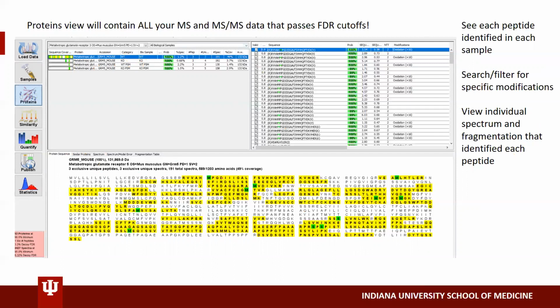If you click on any of these individual peptides, it will link to the sequence and MSMS information listed here in this chart. And this is great because you can actually see your Sequest X-score and delta CN. So this was discussed in Dr. Mosley's Sequest lecture. And because it's really nice to be able to sort and view yourself the quality of each spectra for each peptide. Any of the highlighted residues that are in green just mean there was a modification found.